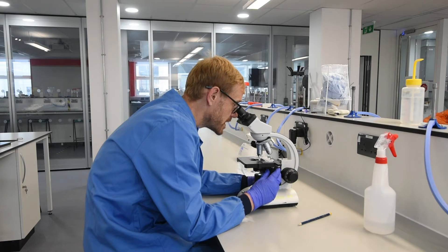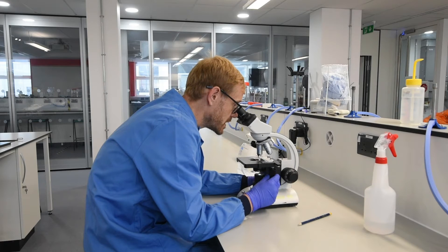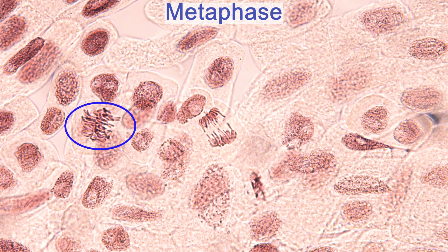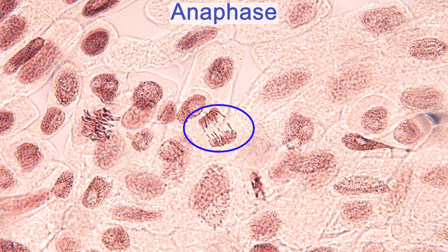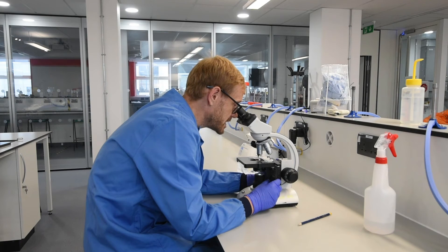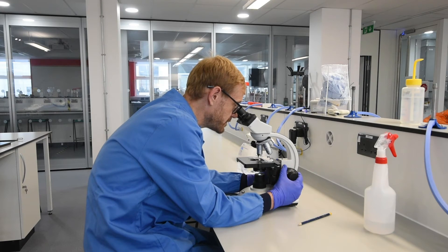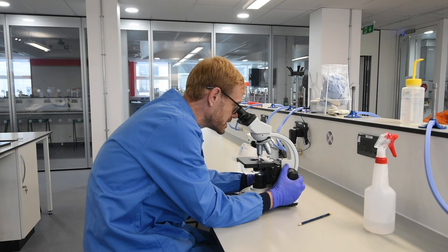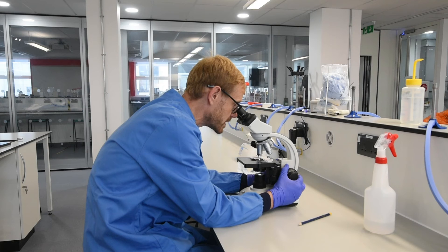We can then move around the preparation using the X and Y knobs on the right-hand side of the stage to identify cells in the various stages of mitosis: prophase, metaphase, anaphase, and telophase. You should quite easily be able to notice those in anaphase and metaphase. The difficult ones to visualize are those in prophase, where the chromosomes have condensed but haven't organized themselves in the center of the cell yet — they basically look like little snakes sitting on top of each other. Telophase is also tricky, especially the end of telophase where the two daughter cells are starting to pull apart as cytokinesis occurs.